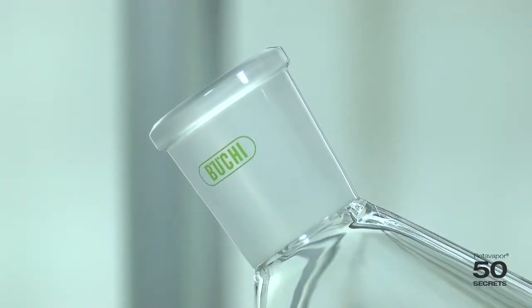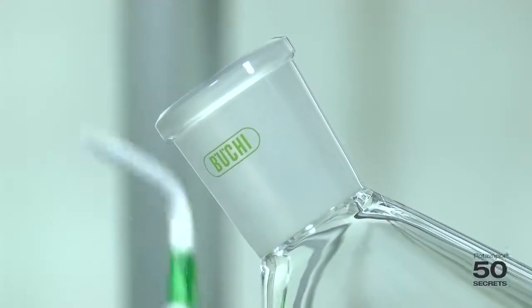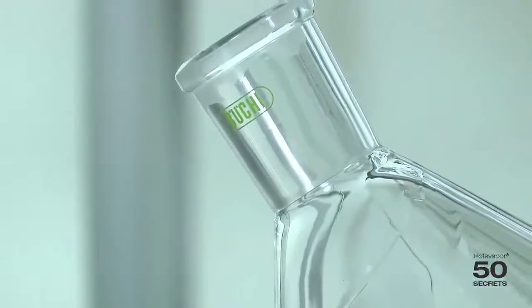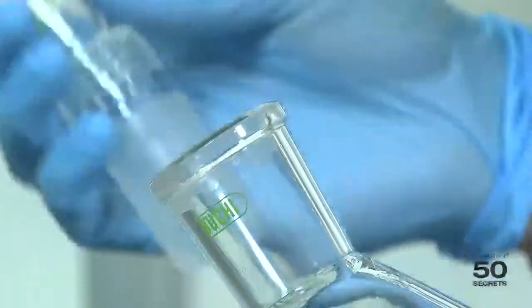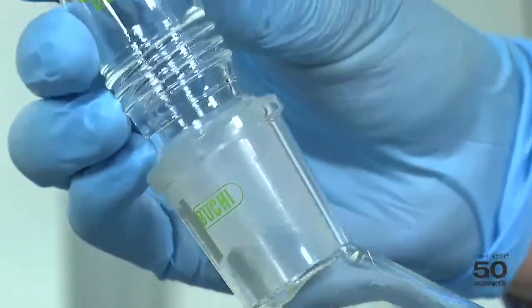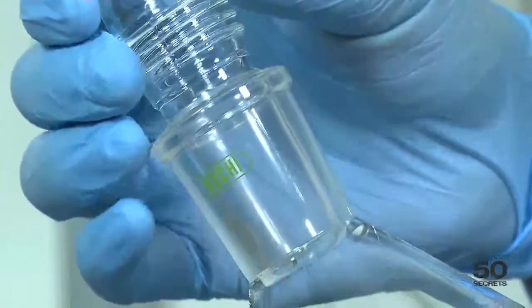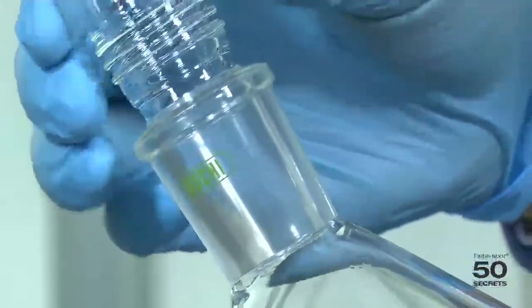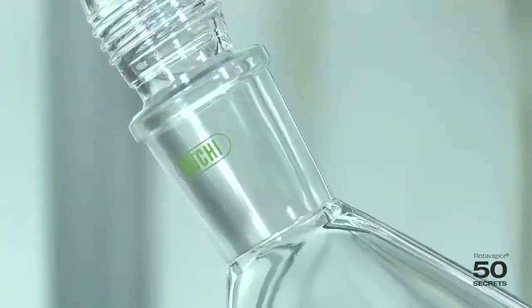In contradiction to the sample we've seen before, I would like to show this flask now. I do exactly the same — I use the same vapor duct. I push it in and there's absolutely no bubbles. You can't move it at all. So, this is a perfect joint.